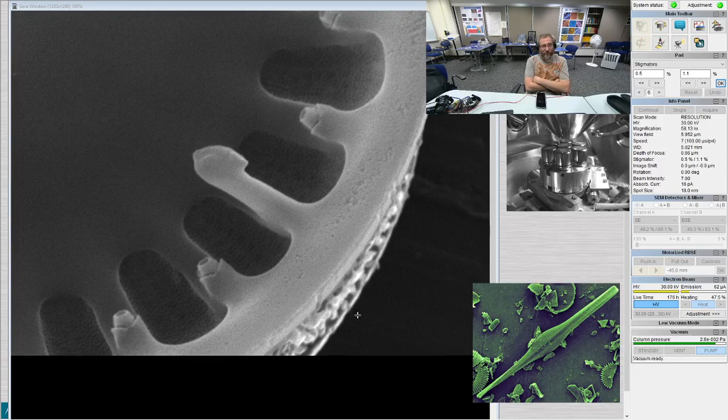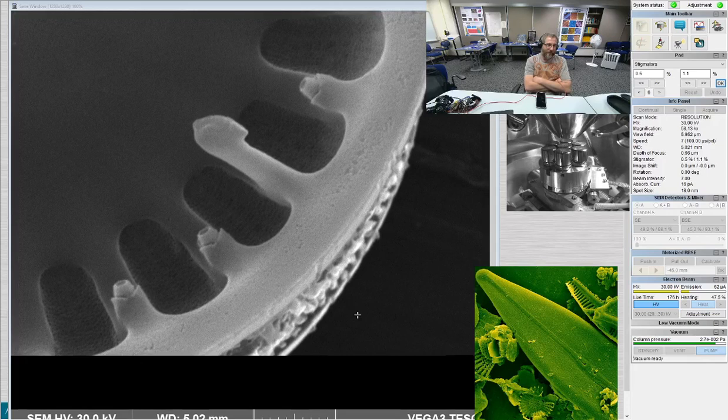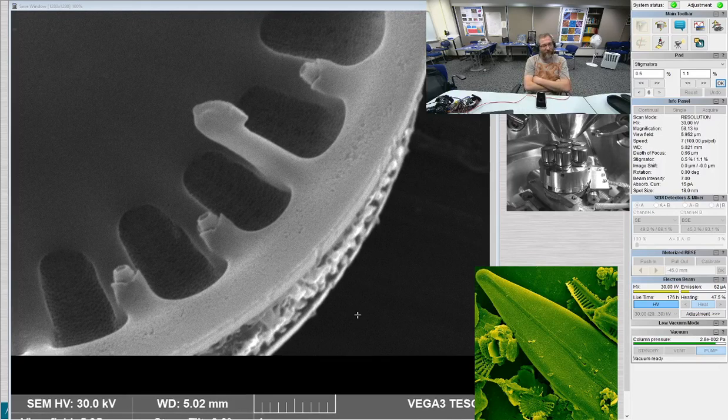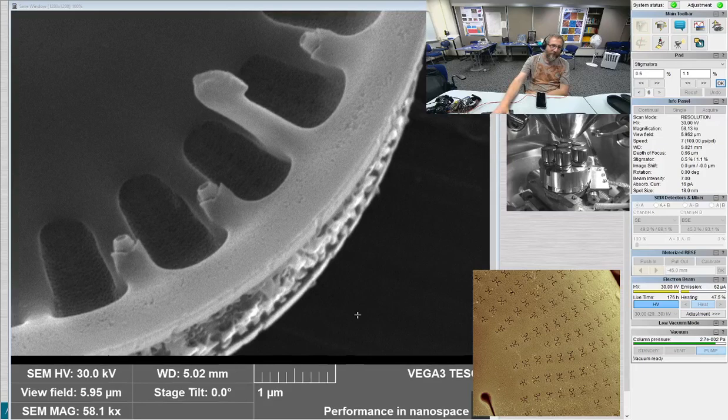It's way up off of the costae. And I can't tell if the lips are facing in a direction. Yeah, it looks like it turned 90 degrees, and it's facing like some sort of a tower with the lips facing out. Super weird.